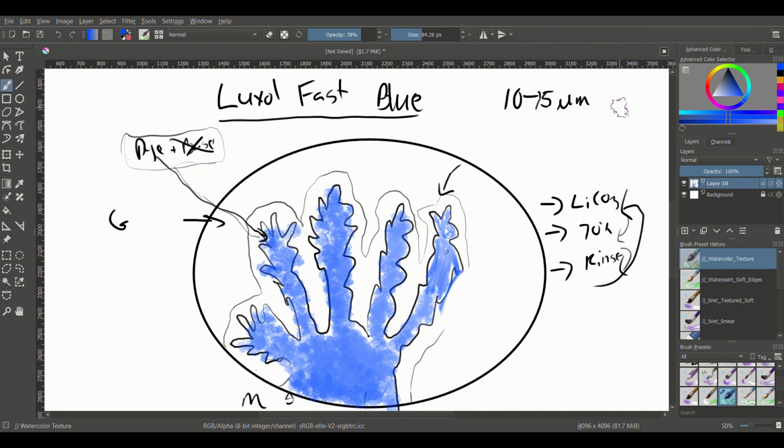And as I said, I'm really just going off the reference material for a lot of this. I've done the stains as a student. I really don't do a lot of these in practice, just because a lot of them have analogs in IHCs. So you probably won't see a lot of these done routinely in the lab, unless that's a specialty of yours. And a lot of these you're going to see actually replaced by immunohistochemical stains, which we'll get to after specials.